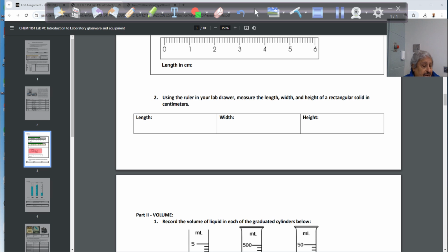Let's see the length here, from 0 to here. The length is, for example, for this object here, 7.5. Yeah, 7.6. So I will write 7.60. 7.6, I will add a 0.